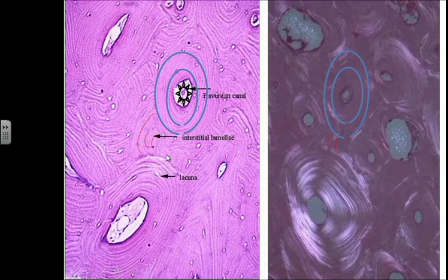But as we have Haversian canal, Haversian canal, Haversian canal, with the circles around, sometimes there is a space between each two concentric, or each four. You have even six because it's a three-dimensional structure, right? Between the concentric lamellae, there is a space created.